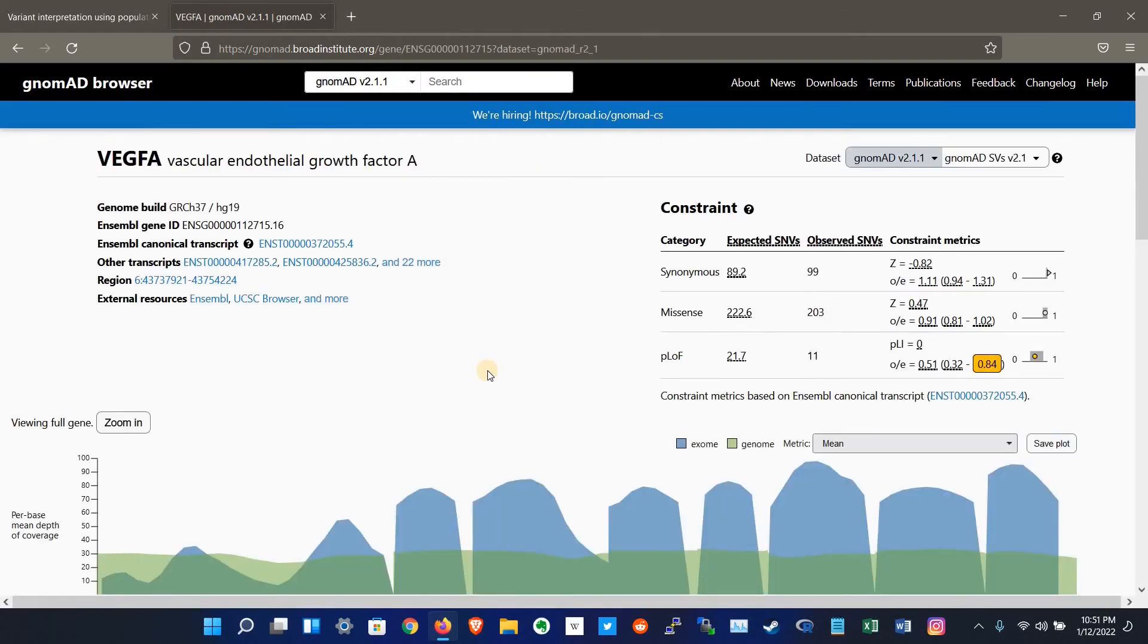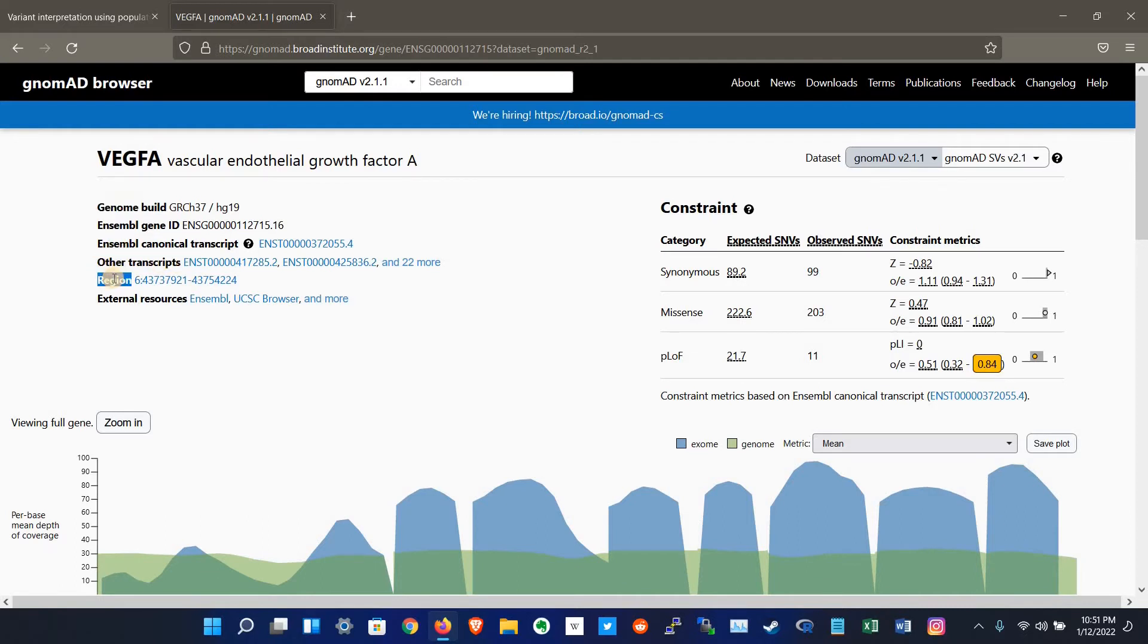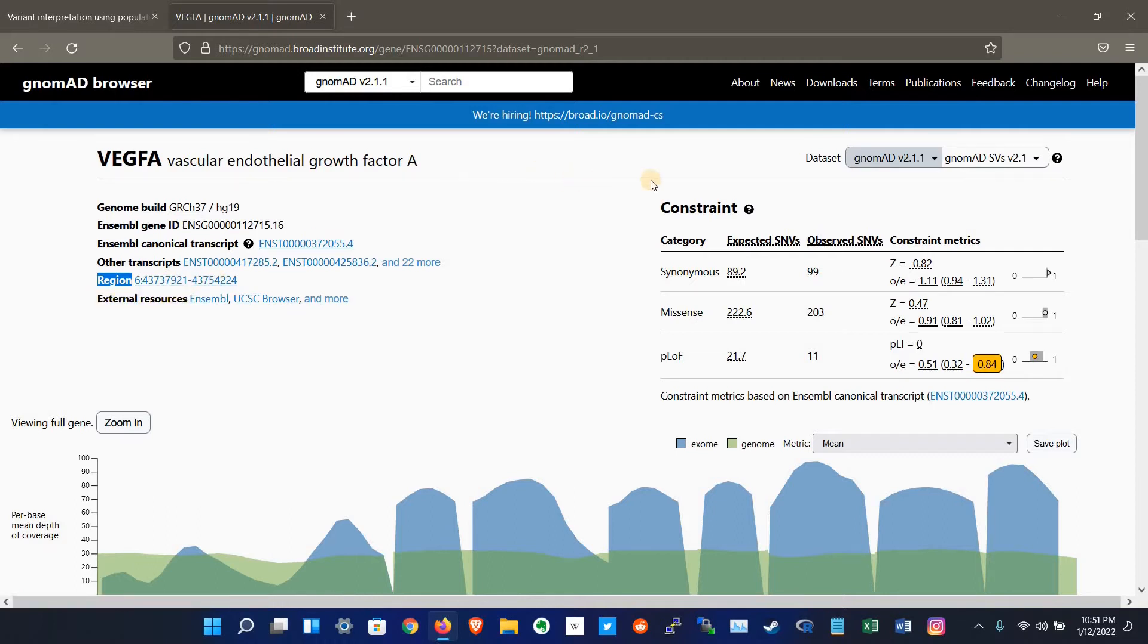So this is the results. It shows the name of the gene and genome build, which is hg19, and Ensembl gene ID, transcripts ID and other transcript IDs, and the region on the chromosome, which is on chromosome number six from this position to this position, and some external resources. Here are the constraints of synonymous and non-synonymous.